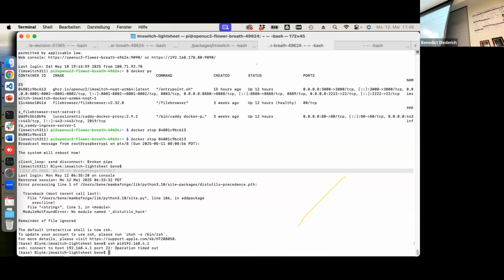Okay. So that you, because the words are only in the basic function form. So this is talking about everything that's not supposed to be coming from the website. I think that was pretty complicated, because if you have a mirror like this, you have to.